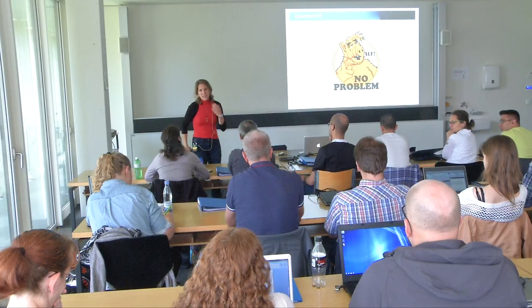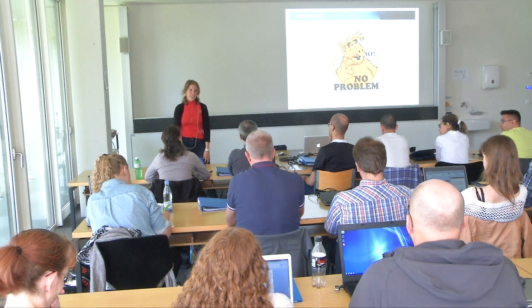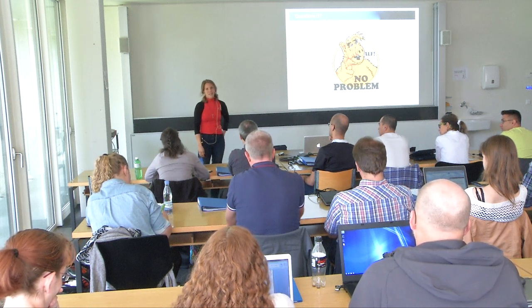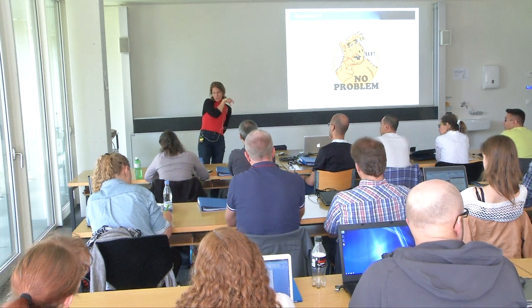I think I'd always take the same background that I use then later on in high concentration, but I think you can use anything. But it makes also a huge difference, and it gets more and more severe the lower the concentrations get.